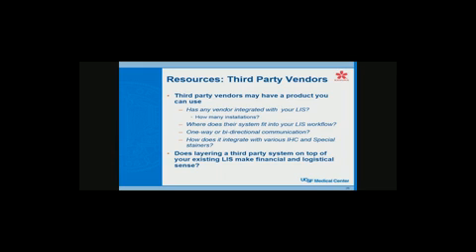Like I said, there's some very good ones out there. I mentioned a couple, but there's 5 or 6 out there that can do it for you. And the thing to think about is, have they ever integrated with your LIS? We talked to several vendors who were very anxious to provide a barcoding system for us, but they had never integrated with CoPath. And CoPath is kind of a little bit leery about integrating with just anybody. They have to be validated, and CoPath will do an approval route for any vendor that wants to integrate with their LIS. They're happy to do it, but it's something that can take a lot of time. So if it's something that you're working on right now, you may not be ready for a while.